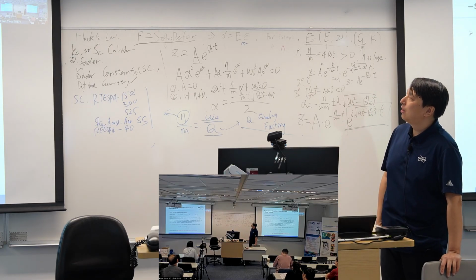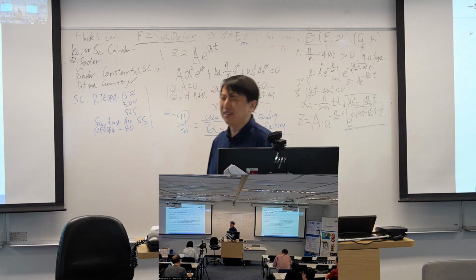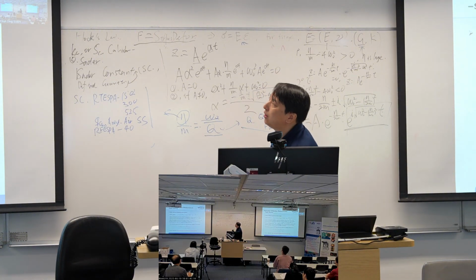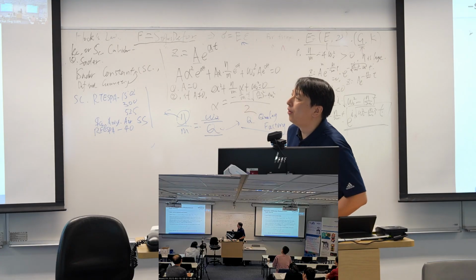Okay, so that's about the Sader method calibration. I would say the Sader method is the first choice calibration method for the spring constant. It is more widely used than the thermal tune, because the Sader method is really quite helpful.